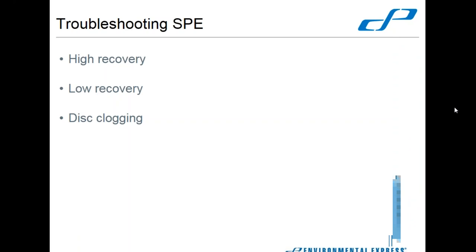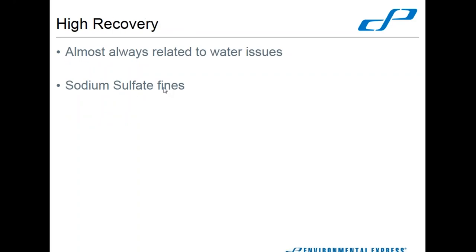We're going to go over to the troubleshooting of solid phase extraction. We've got three basic categories of troubles that come up during solid phase extraction: high recovery of your standard, low recovery of your standard, and disc clogging. I'm going to address them in a slightly different order than what I've got listed.